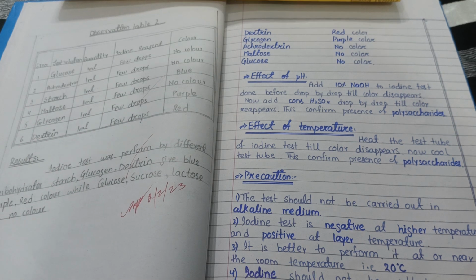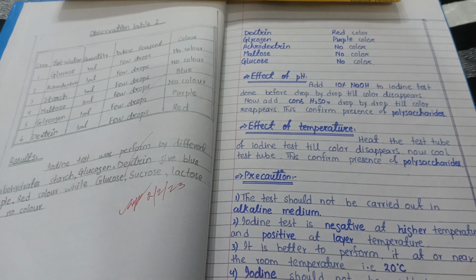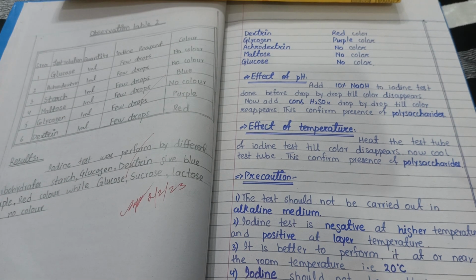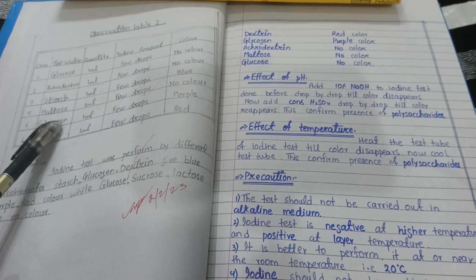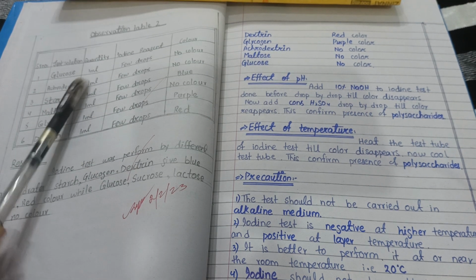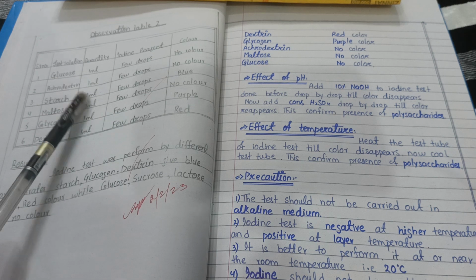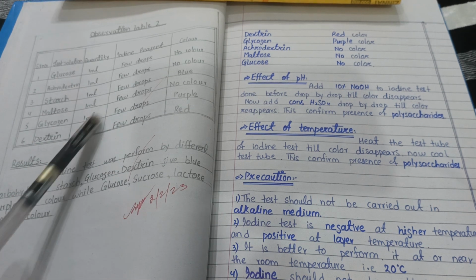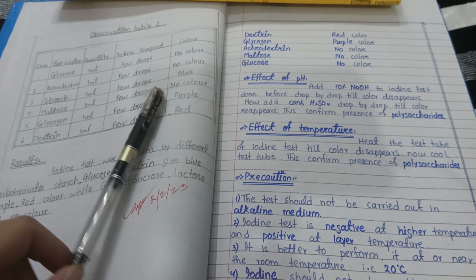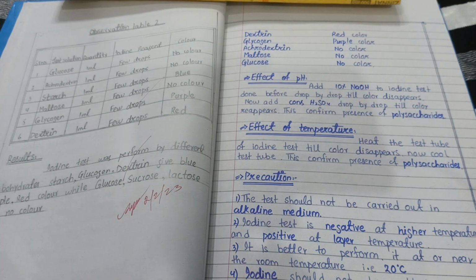So the best temperature for this experiment is 20 degrees, and your iodine should not be in excess. Now on that side we have an observation table. In this table we see what kind of solutions we have and what is the quantity of these solutions. We take 1 ml of all of these solutions. Then we add a few drops of iodine reagent to them, and at the last we see the color of them.